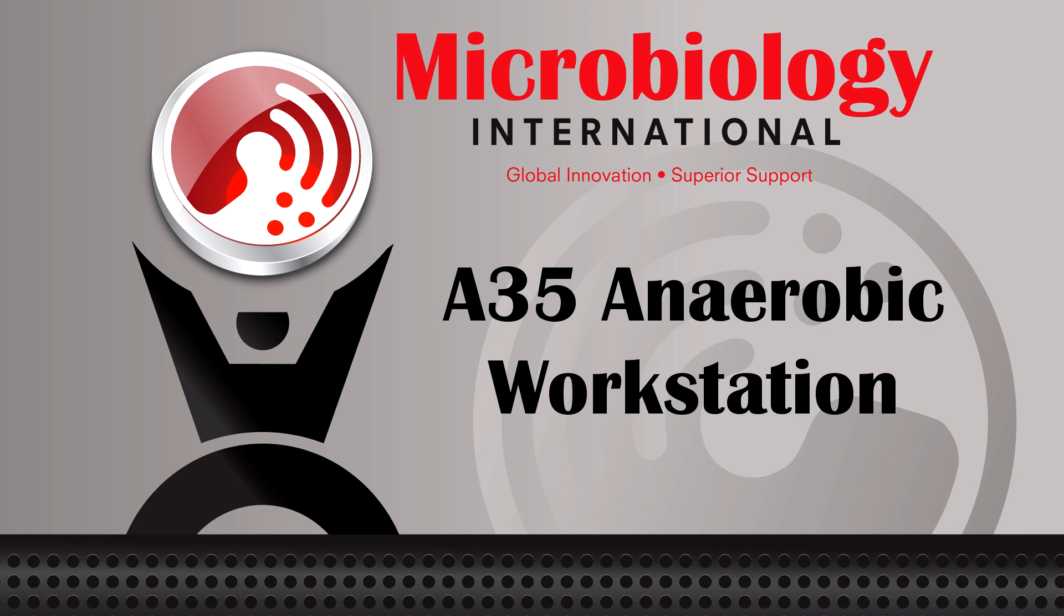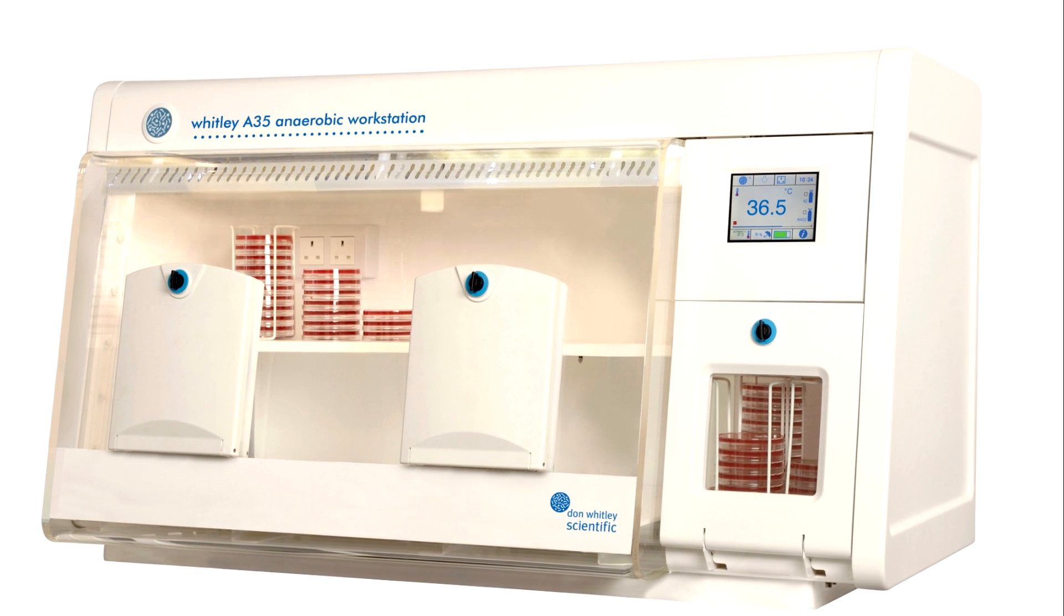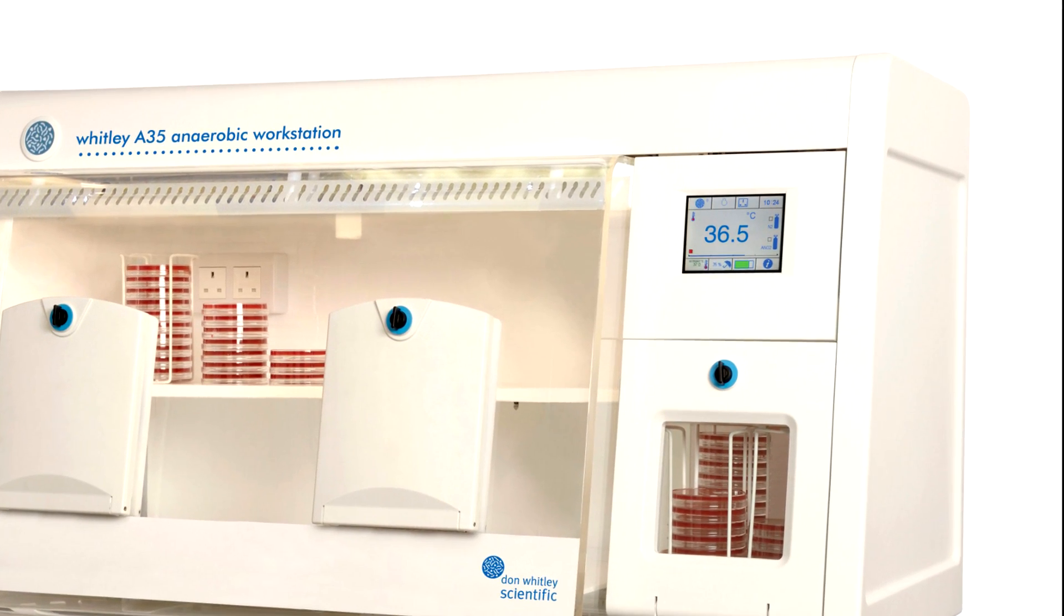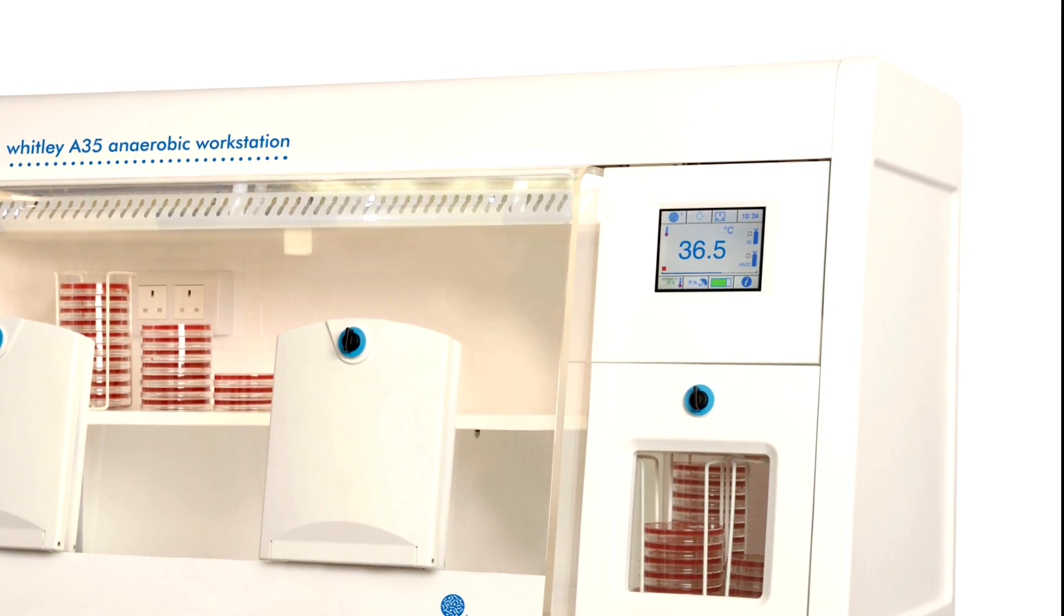The following is a video presentation of the Whitley A35 Anaerobic Workstation. With 30 years of experience in designing workstations for a variety of applications and having listened to our users, the Whitley A35 Anaerobic Workstation is born.